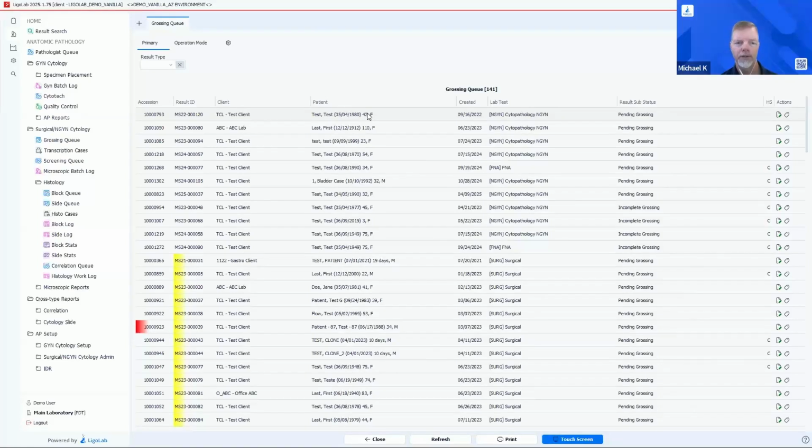All right. And so I understand this correctly. It allows for the prevention of errors as there's a handoff from one department to the next, and then also it doesn't slow down the processing. Correct? You can still move forward with that specimen, knowing that downstream that issue will be identified, and then hopefully corrected. Exactly. Okay. All right.